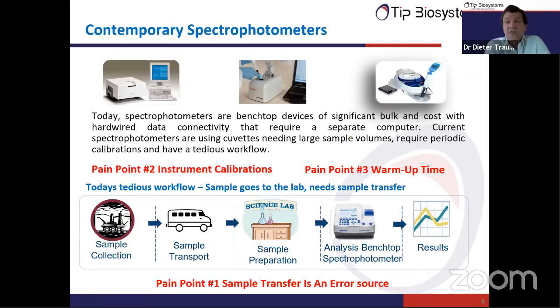Let's consider you have a sample containing algae or something like this, and you want to measure the chlorophyll or the algae density. By the time you transport the sample to your lab, the algae may still continue to grow. Your measurement in the lab might be very accurate, but your sample has already changed. And that's what we call a systematic error.